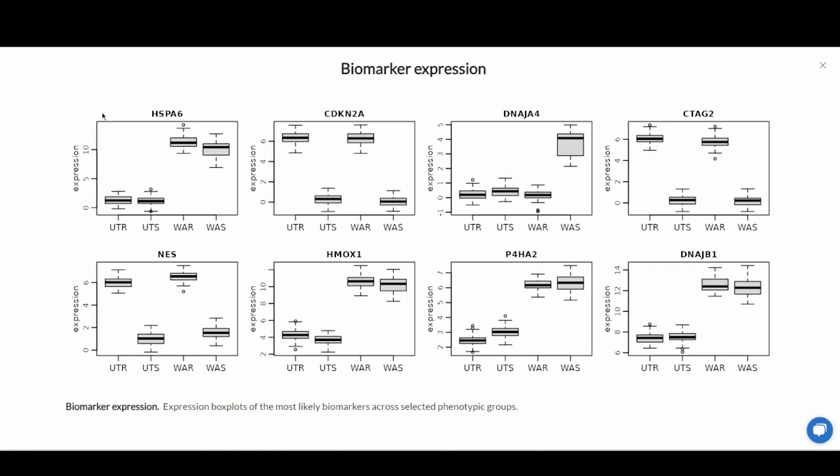You can see the top two correspond to the heat shock protein A6 and CDK-N2A gene that were used to produce the decision tree, and you can see the expression across the different phenotypic groups.